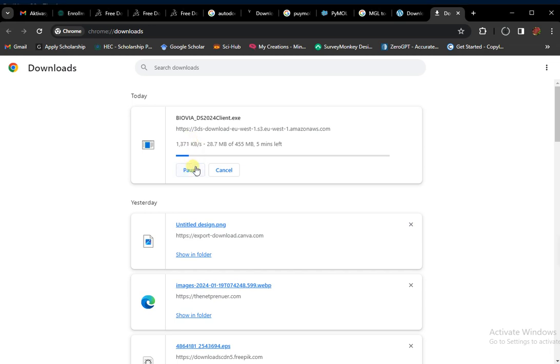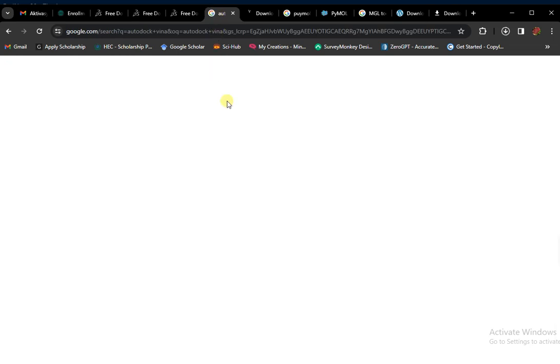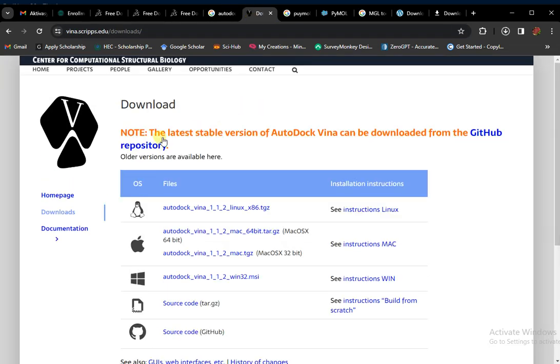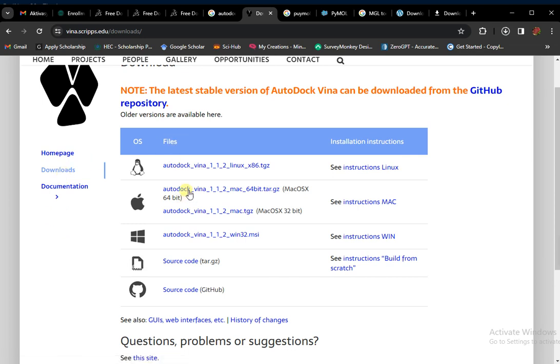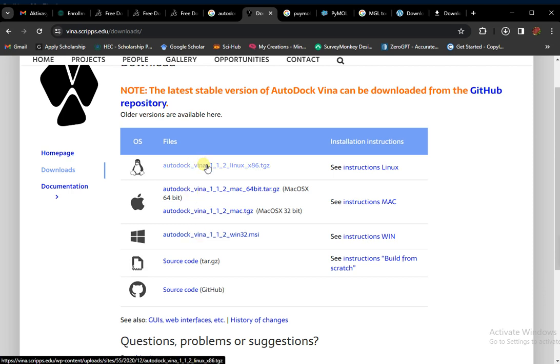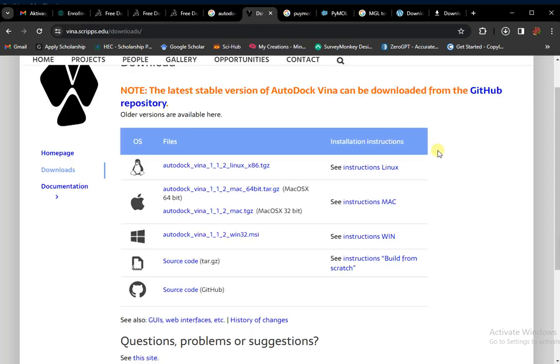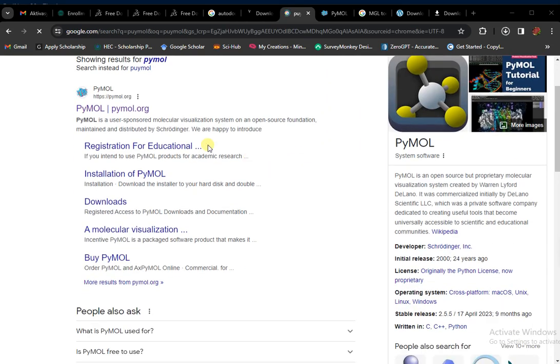Next we need AutoDock Vina. Simply write AutoDock Vina on Google and open the first website. This page will appear — go to Download and download AutoDock Vina for Windows if you have a Windows system. If you have a Linux system, download the Linux version. I have a Windows system so I tap on this and AutoDock Vina starts downloading.